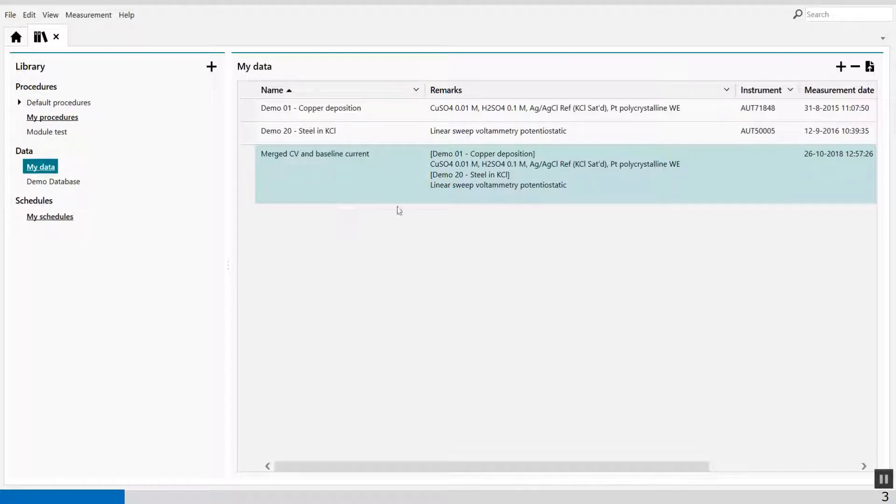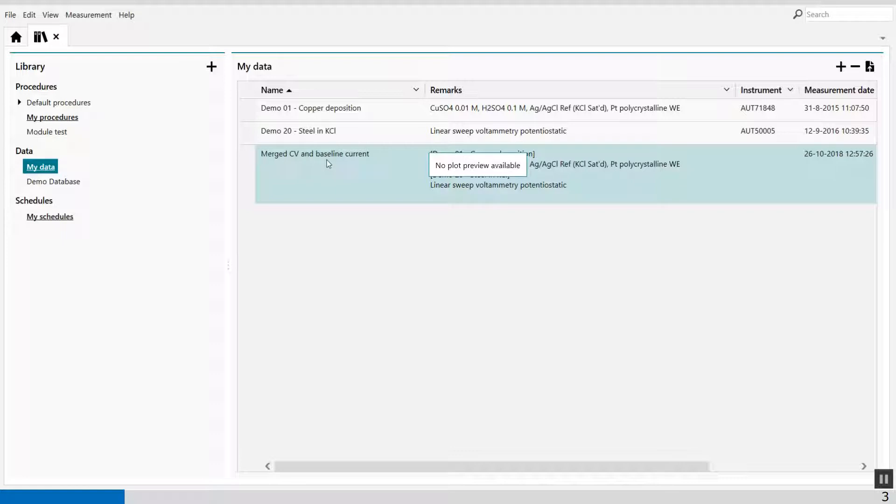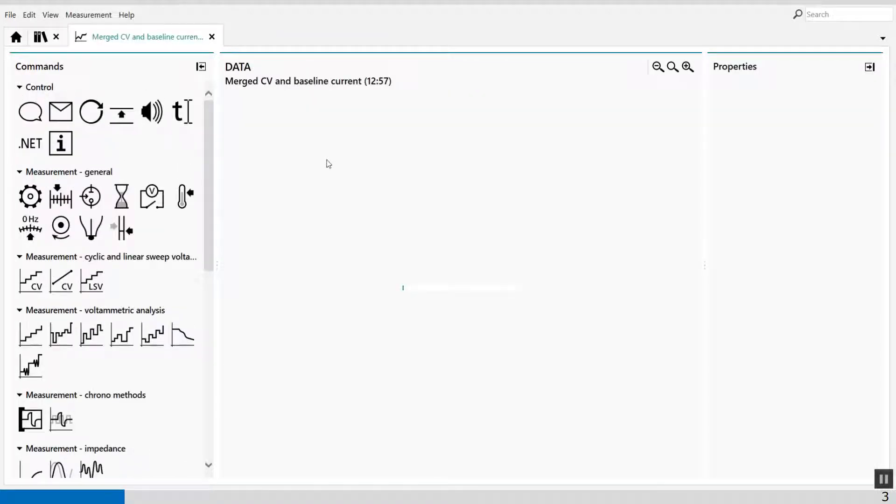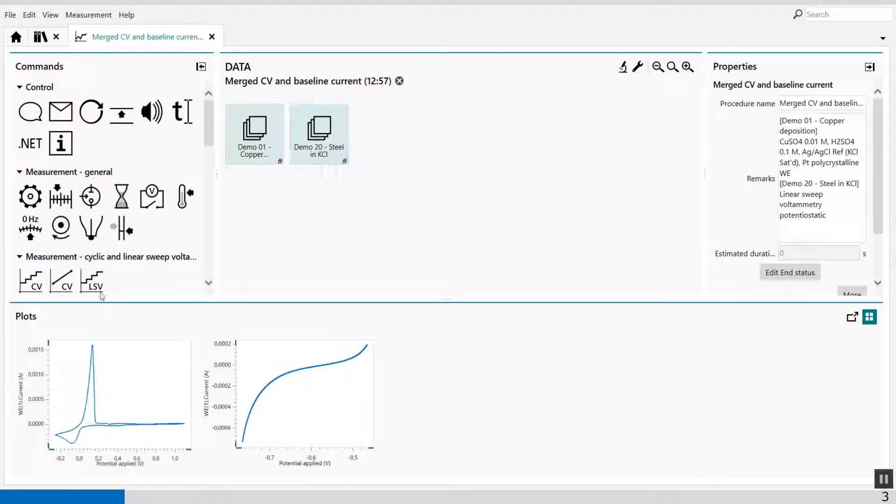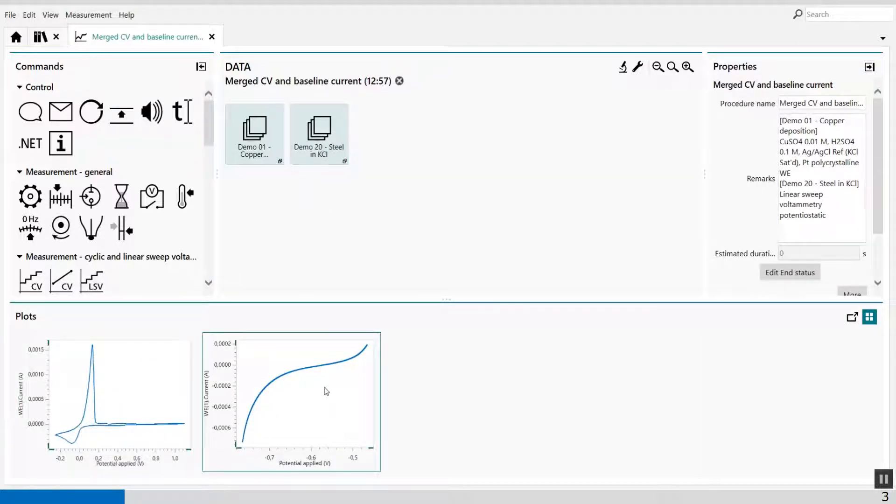Now I've merged these two files together. And when I open this file, then we'll click on it. Both data will be available, so from the CV and from my LSV.